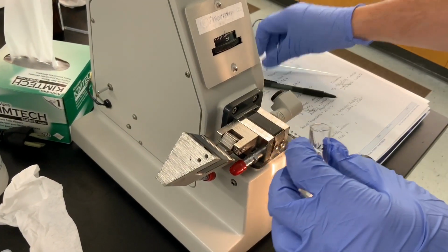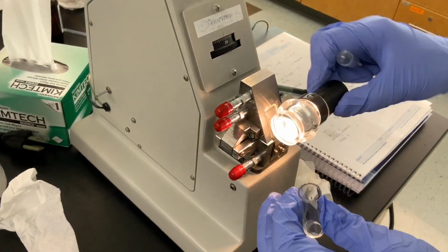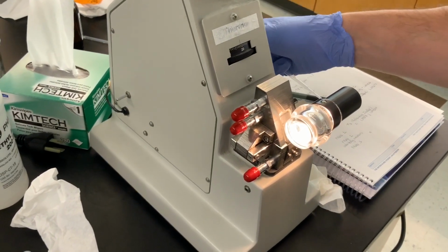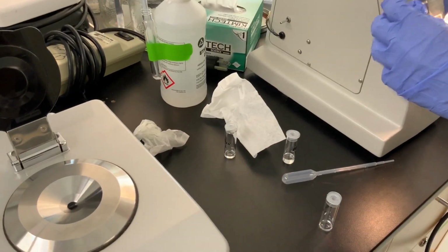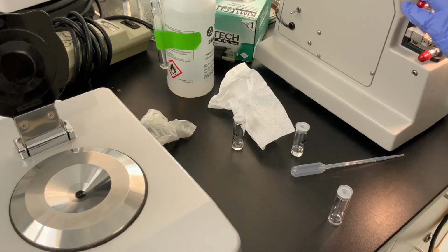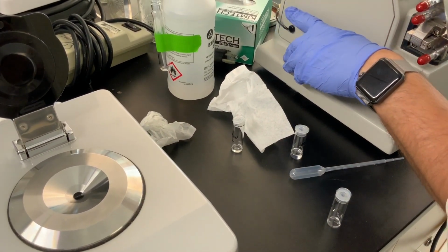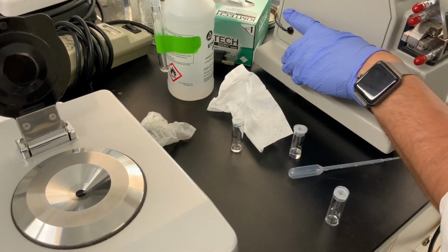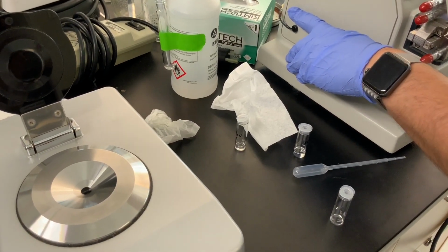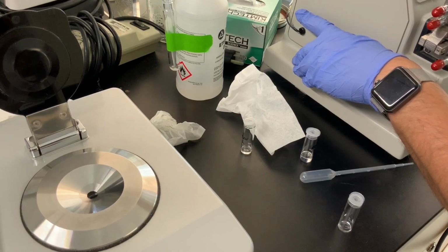So same procedure. Just going to look down at myself. This is 1.440.